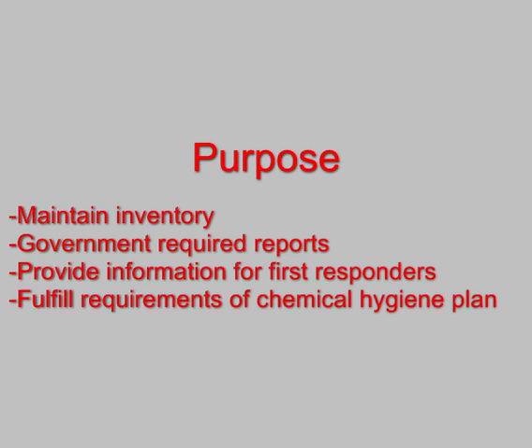The purpose of this site is to maintain your chemical inventory for the various rooms you work in. This information is stored in a central database that can be accessed by safety officers for federal, state, and local reporting purposes, and by the fire department in case of an emergency.